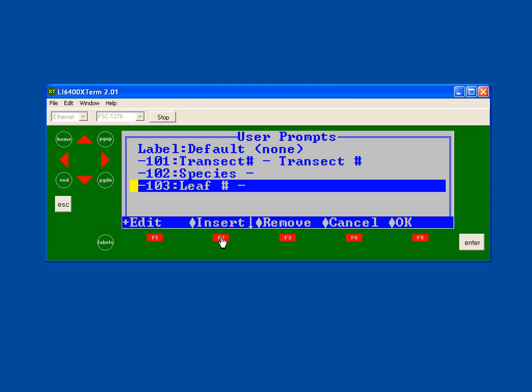Now keep in mind you can always recompute your data. If you don't know that information as you go along, you can always go back and recalculate your data in Excel and modify that. But if you know it as you go along, it will give your on-screen estimates much closer to the true value.